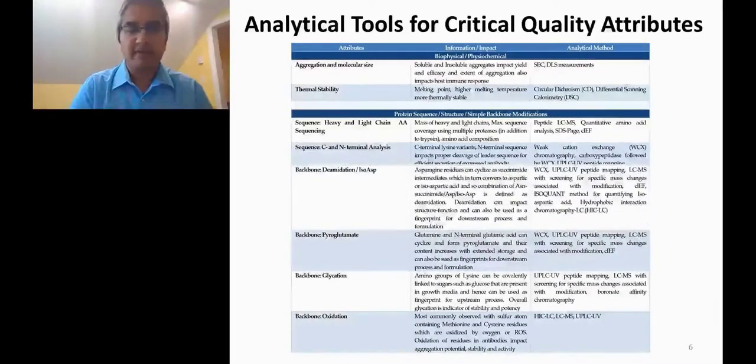In a similar manner, deamidation of asparagines plays a very important role in structure function, depending on the location of some of these residues at the key interface of epitope, paratope interfaces. And again, they provide important signatures of both downstream process and formulation as well as product quality.